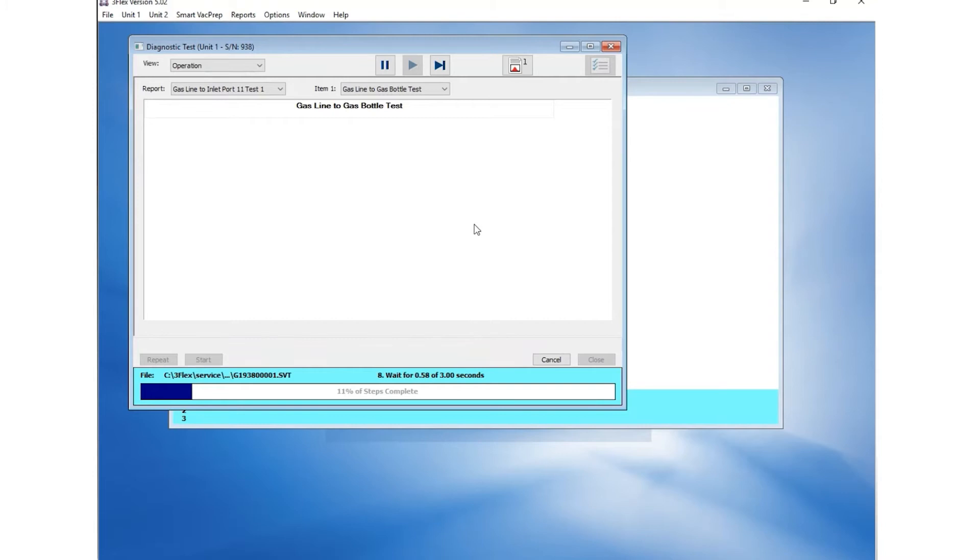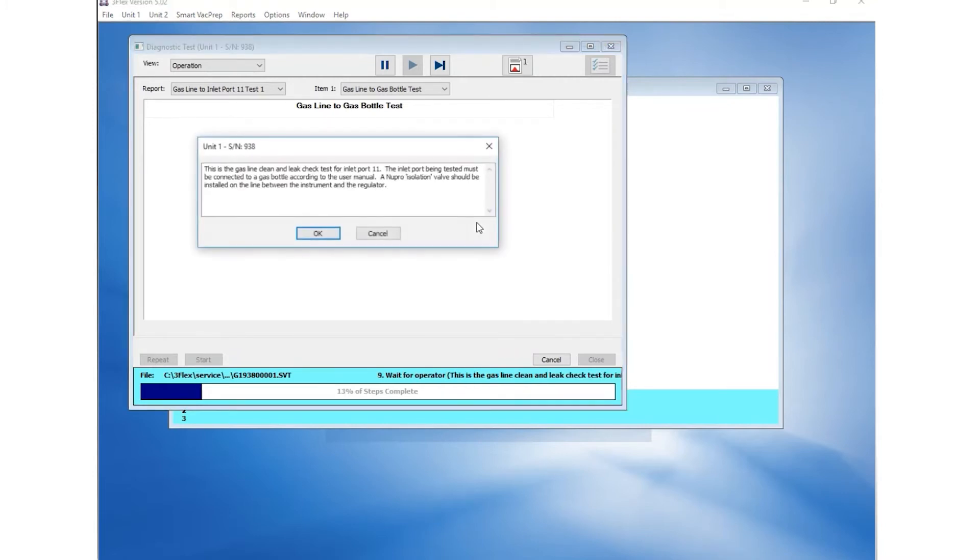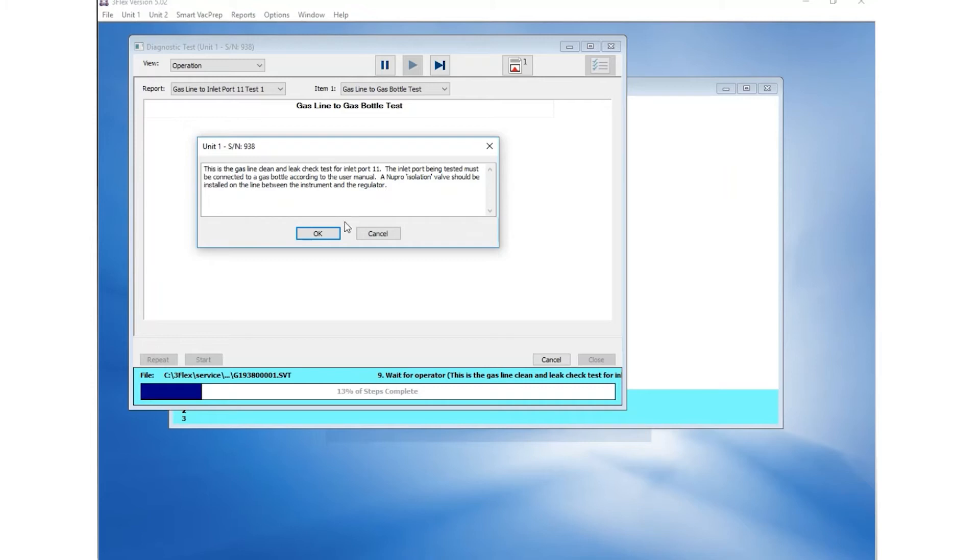The instrument will prompt a message indicating the gas line valve number under test. Verify that this is correct and that the gas cylinders are connected according to the operator's manual and your facility safety requirements. Click OK.